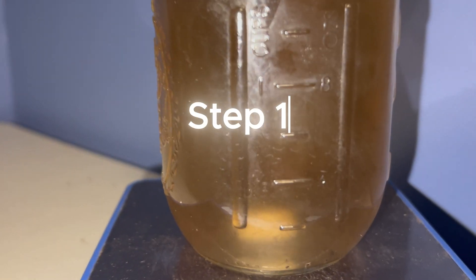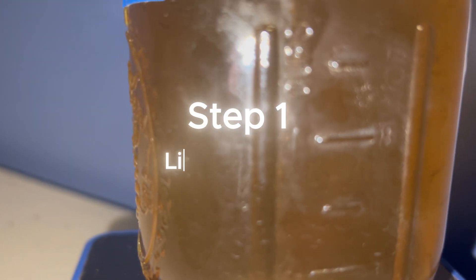The first step is to acquire a culture of Tremella fusiformis and Annulohypoxylon archeri, and you want to use those to inoculate liquid cultures — so you want to have a liquid culture of each of them.